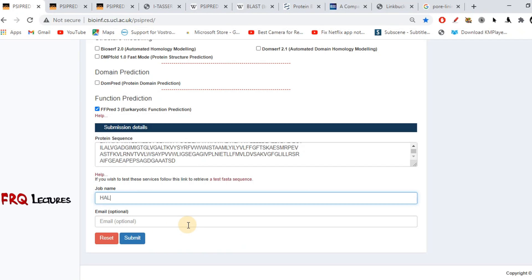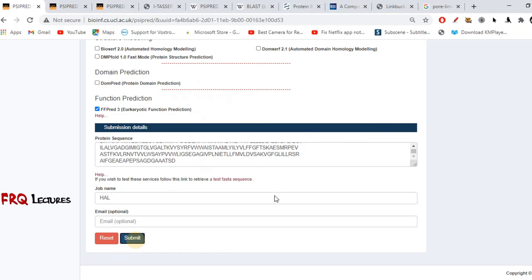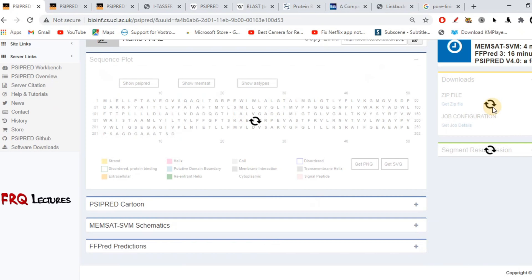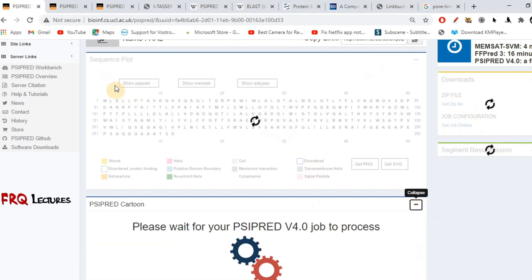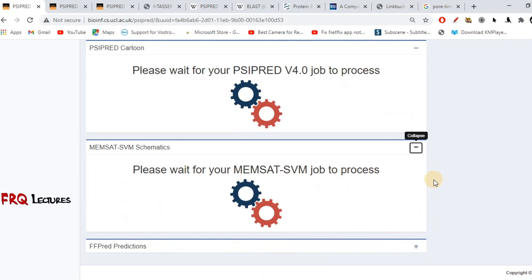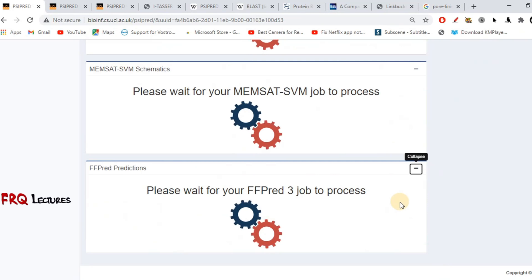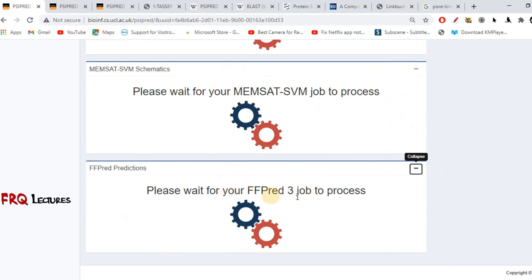Email is optional because they can display the result within 10 to 15 minutes in a new tab. After clicking OK, it will take about 10 to 15 minutes to display our result. You can see processing icons indicating our sequence is being processed. The first two portions predict the secondary structure, MEMSAT will indicate transmembrane, cytoplasmic, or extracellular sections, and FFPRED will predict functions related to our query protein.